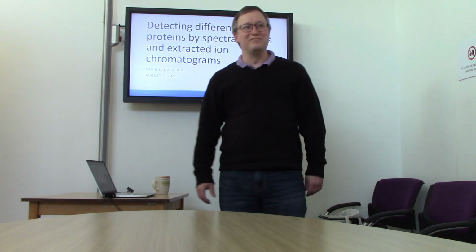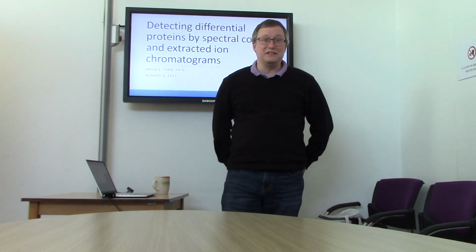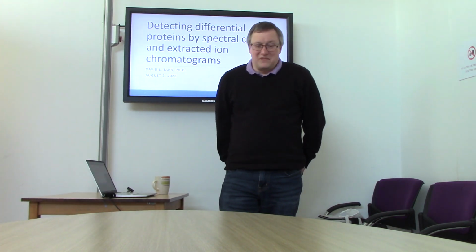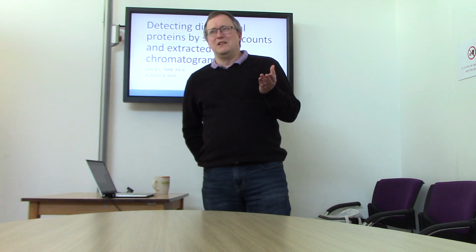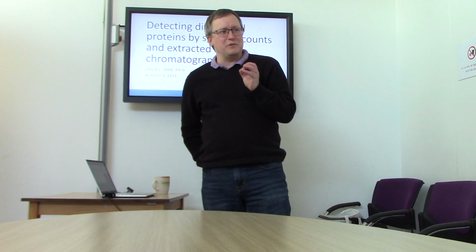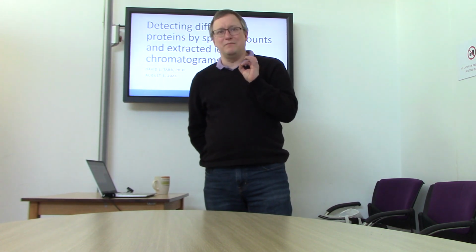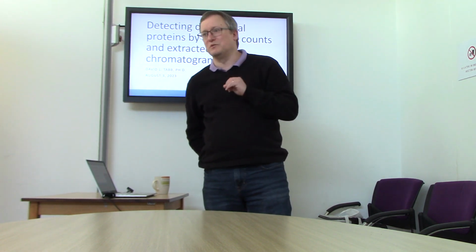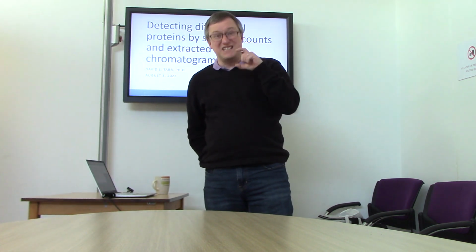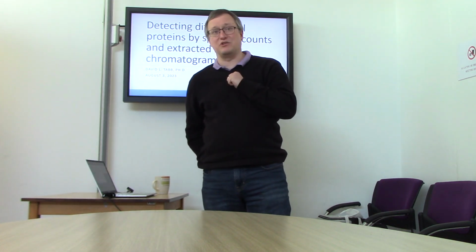Good morning, everybody. I am glad to talk to you today about label-free quantitation. I think that a lot of people assume that if it's in the mass spec, it's got to be quantified in some way. The reality, as we're going to get into in the course of this lecture, is that mass spectrometers are very, very good at making mass measurements, or mass-to-charge measurements more precisely, but that there's quite a lot of play that comes out in the intensity that we measure from mass spectrometers.